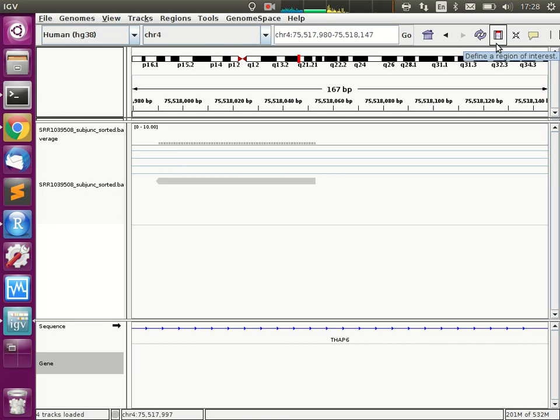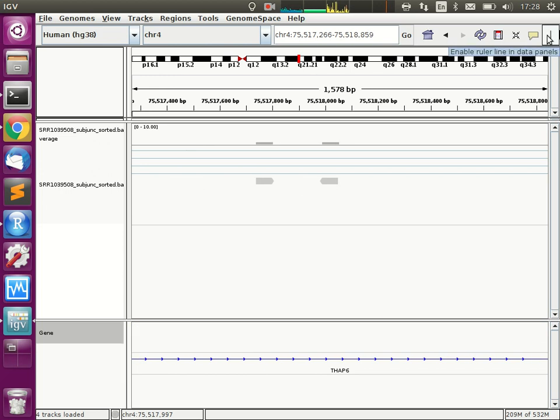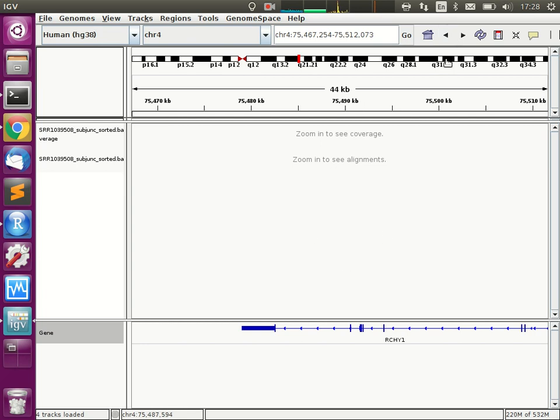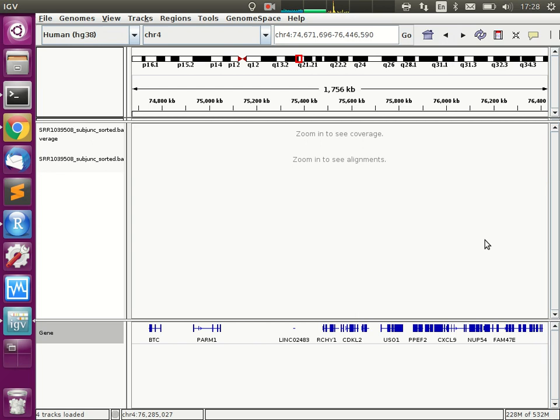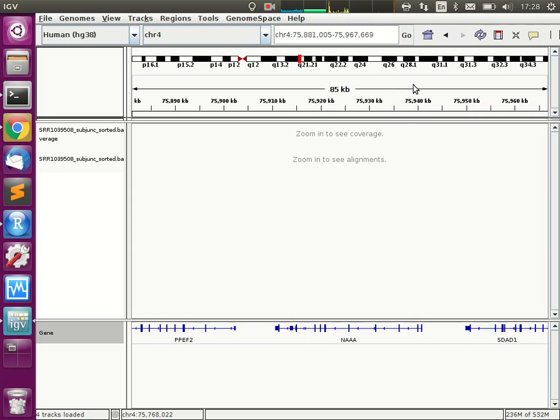The important part that I want you to see here, and which you can't see. What do you do if your screen is too small to see the button that you want to see? Now I can't zoom out. So what I want you to see is how uneven the coverage is in these things.